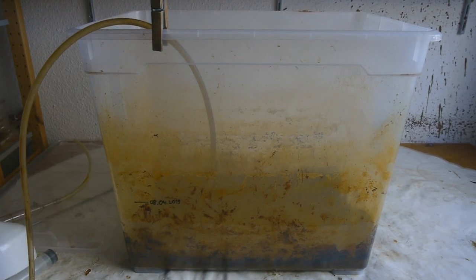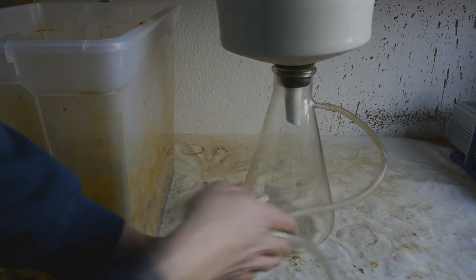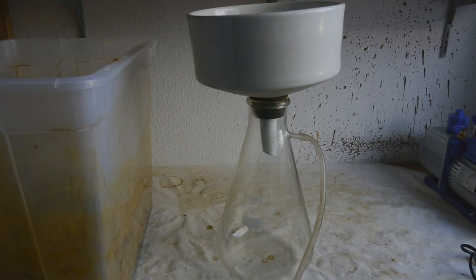Everything is siphoned off now. Let's say most of the water. This is what it looks like from the top right now. And now let's try to filter everything off. So here we have a special big filter. And now let's see if we can somehow transfer everything in there.